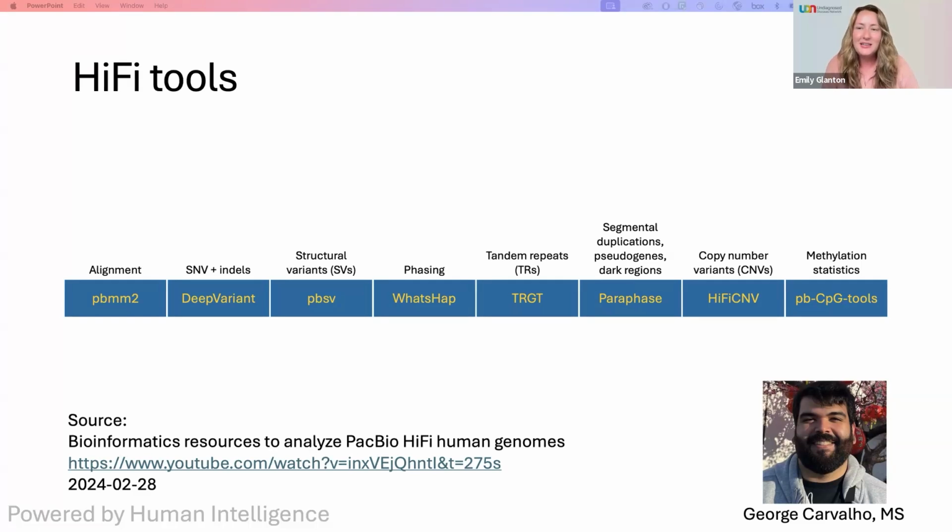So the last question is a case example. Recently at one of our other clinical sites, we had a case that was strongly clinically consistent with Shwachman-Diamond syndrome, and the genome was negative for the gene associated with that condition. According to the reading, it seems like there is a highly analogous pseudogene. So they were wondering if you've ever run into this type of situation with a pseudogene, and if you think that long read might be necessary to detect the homology.